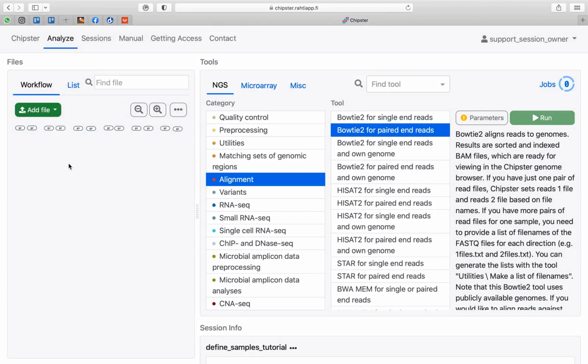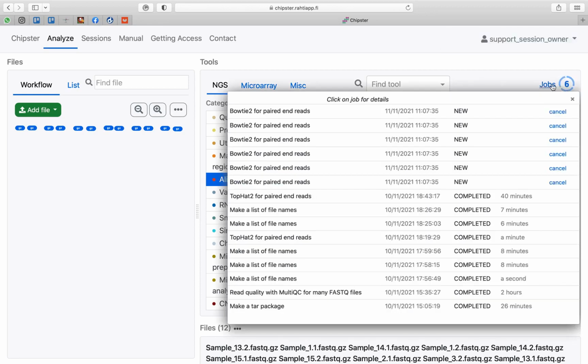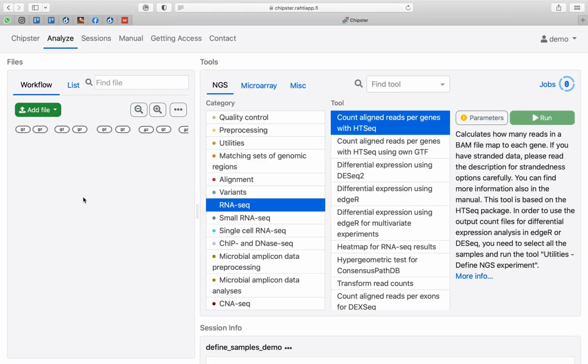about your samples saved. So if we again select all of them like so, and now go to the run, you can see that there's this option now, run tool for each sample, and it's saying that it will launch 6 jobs because there are now 6 samples. So now I can just click this, and you can see that 6 jobs are launched, and as a result we get the result files for each of these pairs.